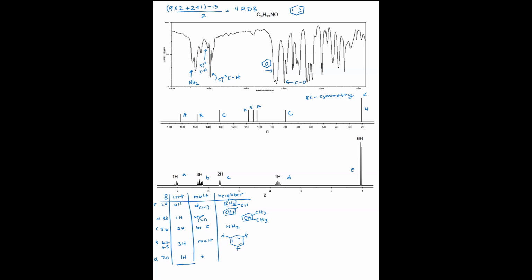So tally up my hydrogens, 13 H's, which is what we want. Carbons, I have 6 in the ring, 7, 8, 9. So that symmetry that we see, I think it's these 2 carbons right here in the CH3, which is why we have 9 carbons here. So that accounts for that 8 carbons in the molecule. So my puzzle pieces are an isopropyl group. I have a benzene ring with a 1,3 substitution. I have an NH2, and the only thing I'm missing is an oxygen.